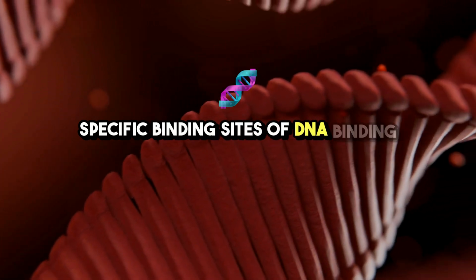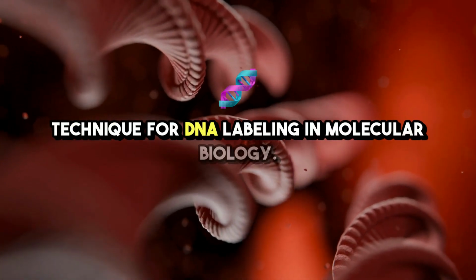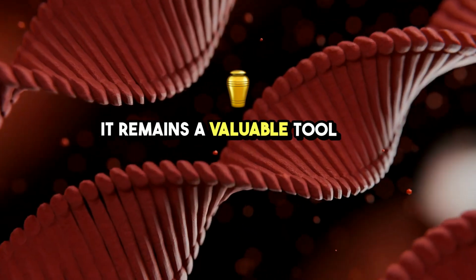sites of DNA-binding proteins. Nick translation is a versatile and essential technique for DNA labeling in molecular biology, with applications ranging from probe generation to genomic analysis. It remains a valuable tool for researchers.